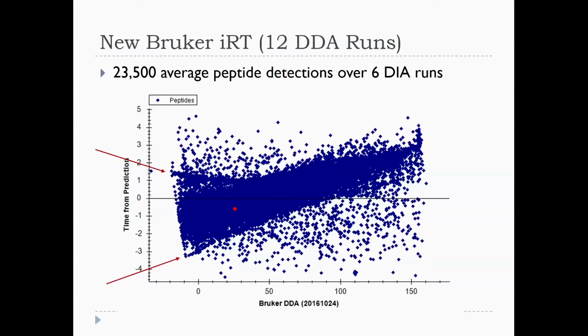And what were they based on? 11 spiked-in peptides, but each individual iRT is based on something. So what was the measurement that we said, we know where this peptide comes out? What was the mass spectrometer giving us that allowed us to say, I know where that peptide shows up?